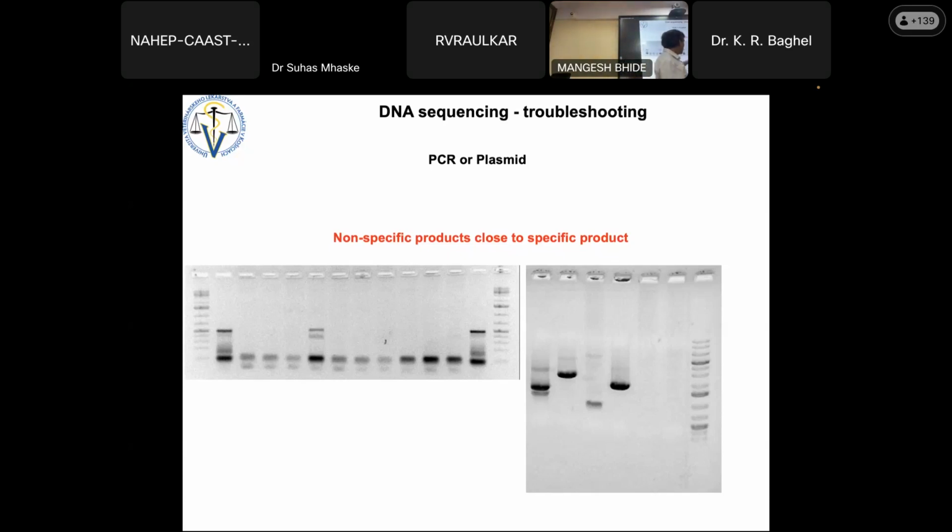In this case, you have this band, this band, this band. Which band should I cut? They will ask. They never ask you, right? So what they do, they just pick the brightest one, sequence, and send you the result. But that result might be not your result.